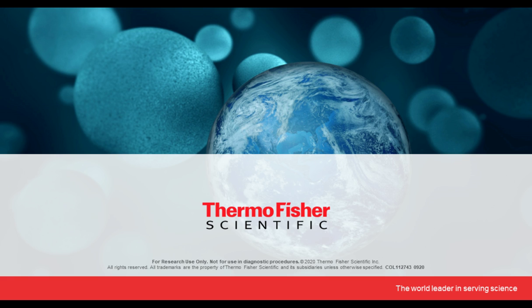Thank you. We have time for just a few more questions. Does the probe attach to more than one lysine in a protein? Yes, that's a great question also. Every protein has multiple lysine residues because it is one of the most abundant amino acids within a protein.